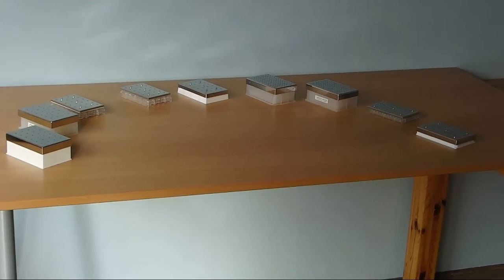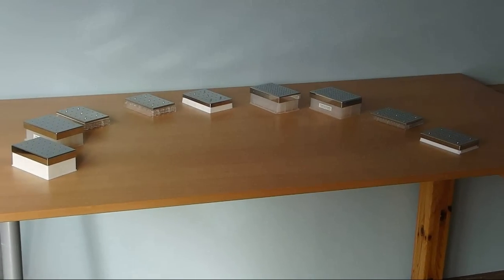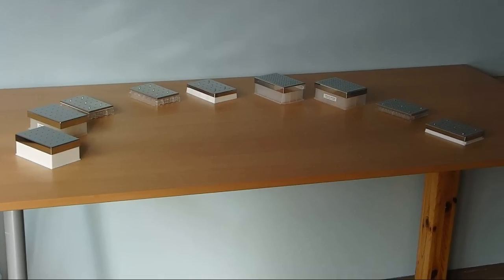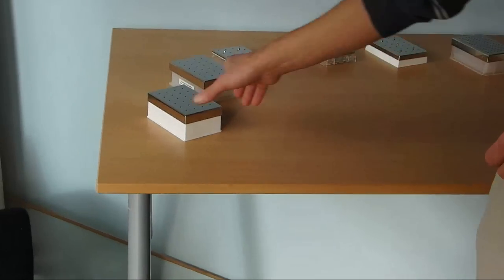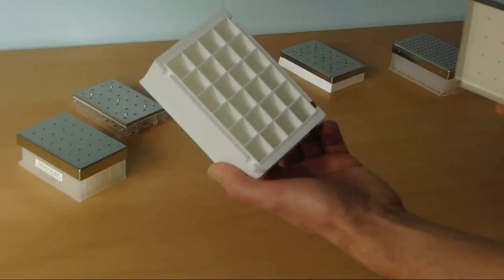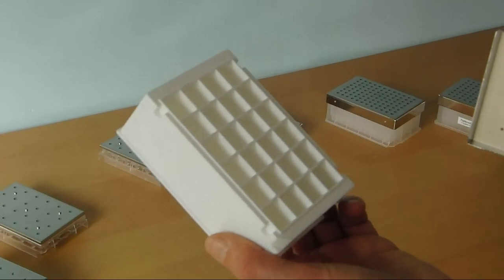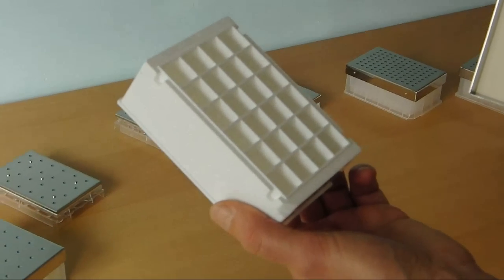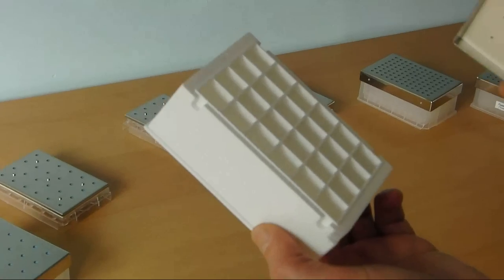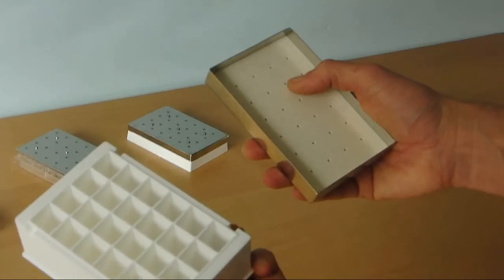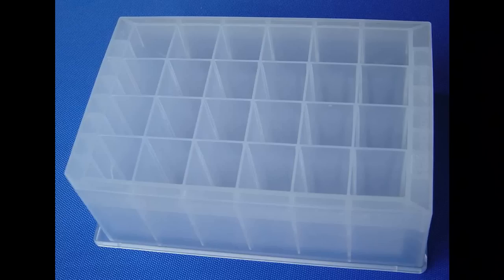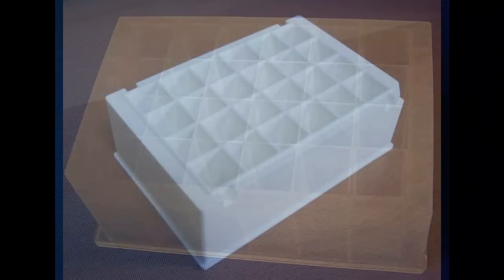We supply sandwich covers for a wide range of different microtiter plates. In the introduction, we already showed the square 24 deep well plate. It is the most versatile and most widely used microtiter plate and it allows culture volumes of 2-4 ml. These plates are available in reusable polypropylene and since 2011 also in disposable polystyrene.